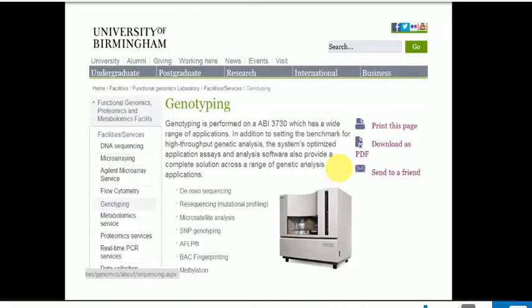This is the kind of kit you use, so this looks very different from a PhD student pouring gels. And essentially, you put the plate in, press the button, and walk away, and everything else is done automatically. And as well as sequencing, resequencing, there's lots of other things that these machines can do. But all of it is to do with generating DNA sequence that you can subsequently analyze.